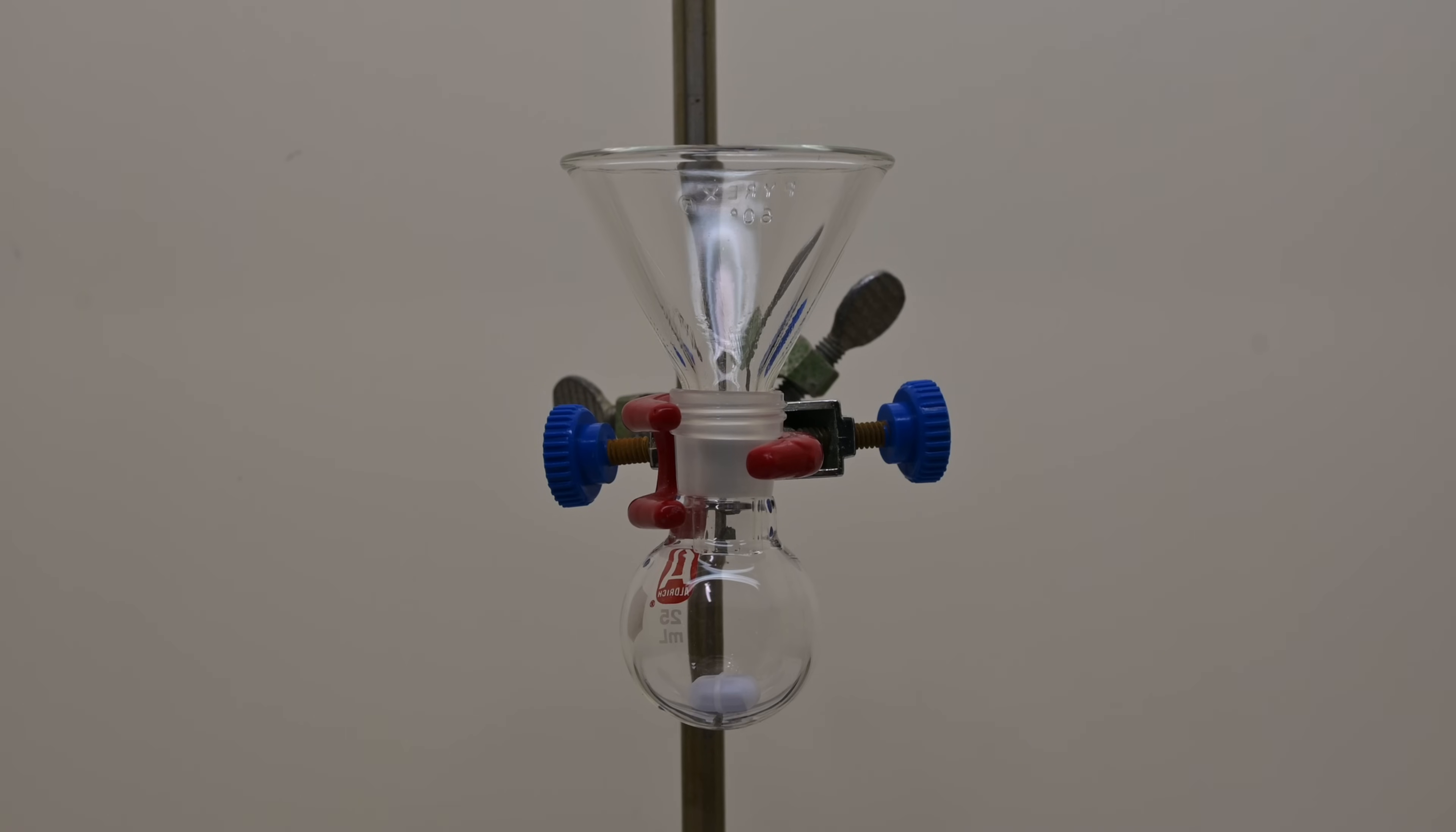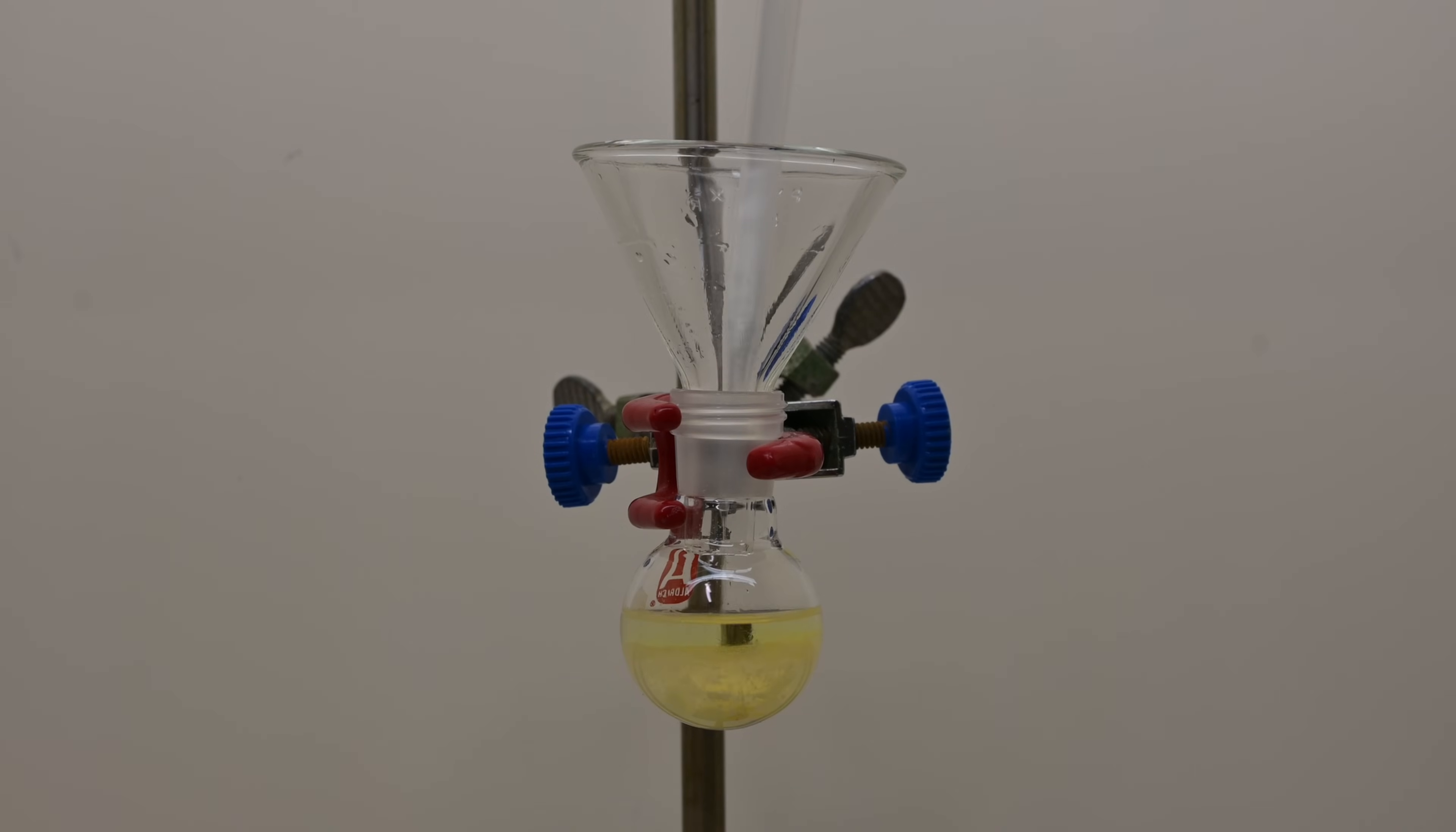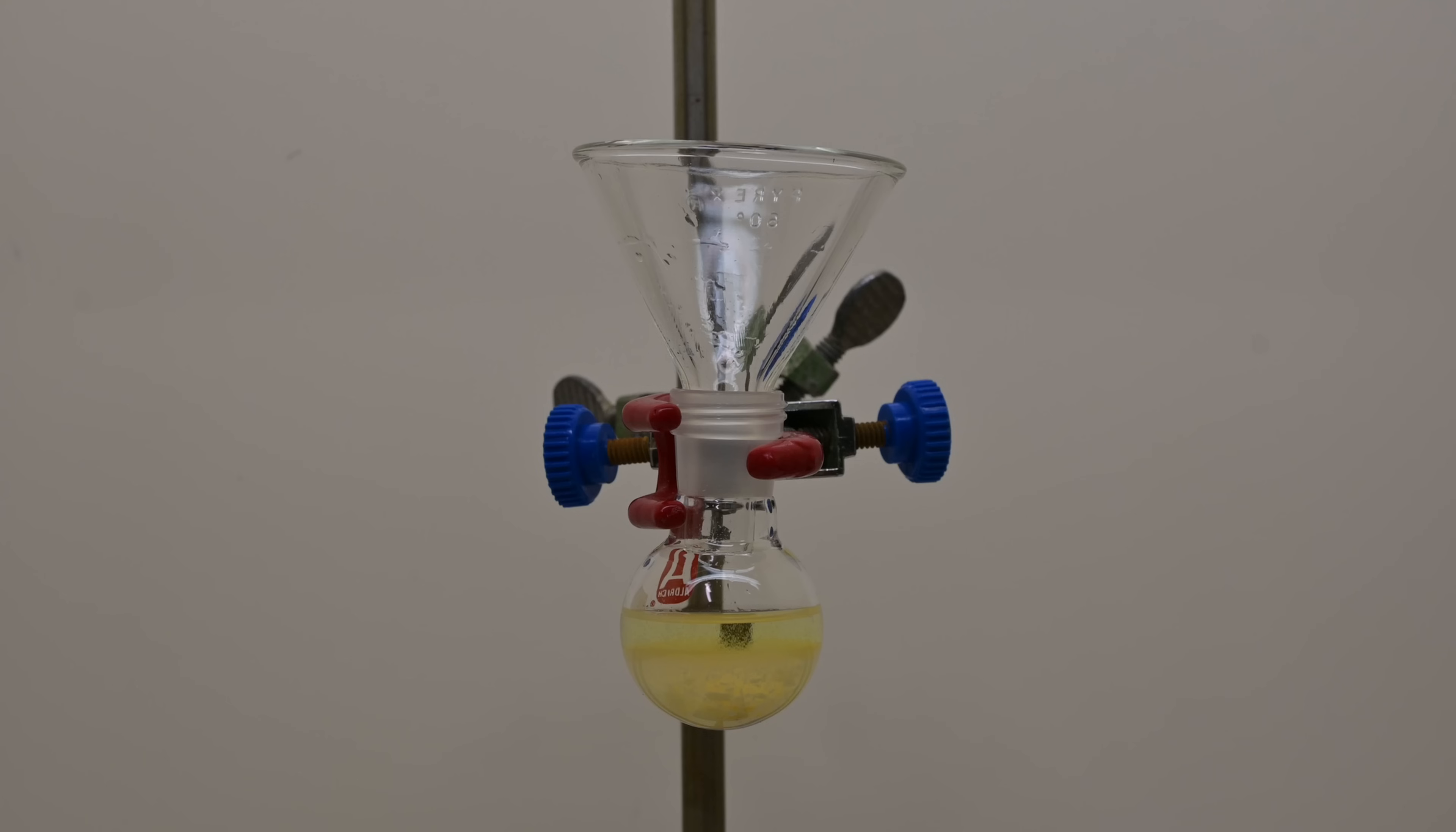In this synthesis, we begin by carefully measuring and combining our reagents: 1 gram of benzil, 1 gram of urea, followed by 15 milliliters of ethanol, and 3 milliliters of 30% aqueous sodium hydroxide into a small round bottom flask. The role of sodium hydroxide here is crucial. It deprotonates the urea, significantly increasing its nucleophilic nature and enabling it to effectively attack the carbonyl carbon groups present on the benzil.